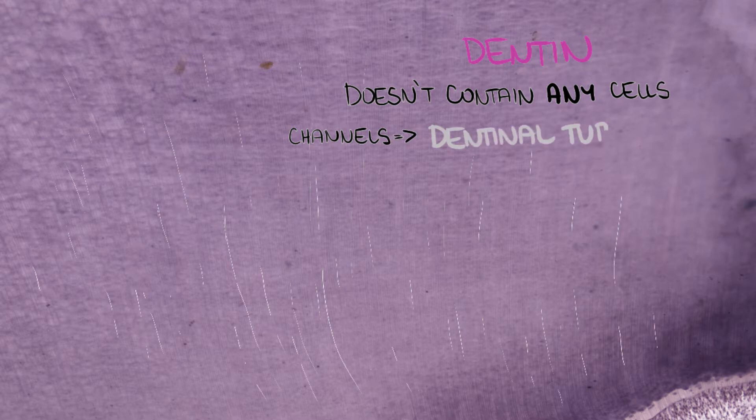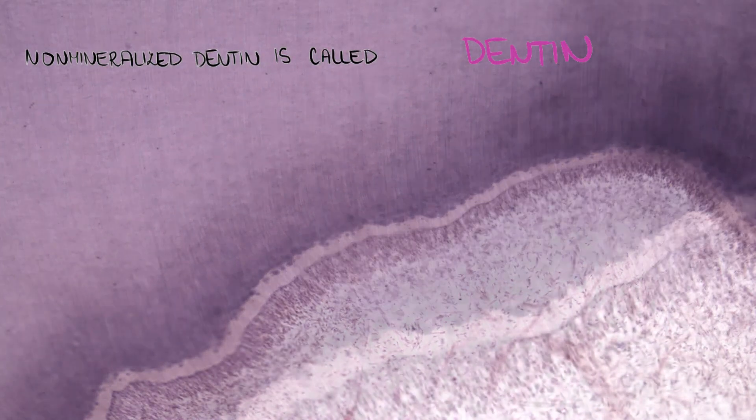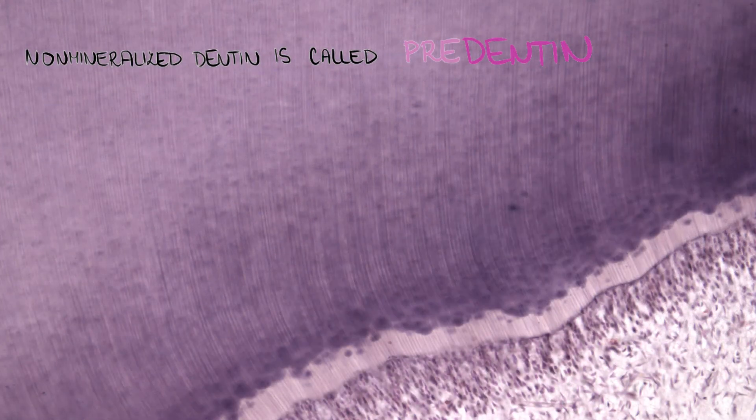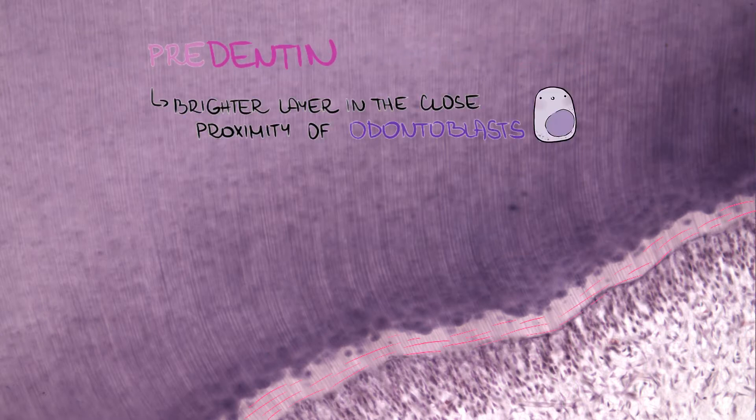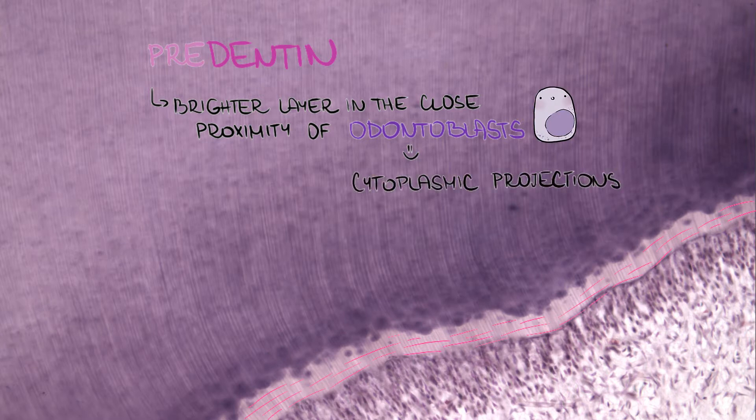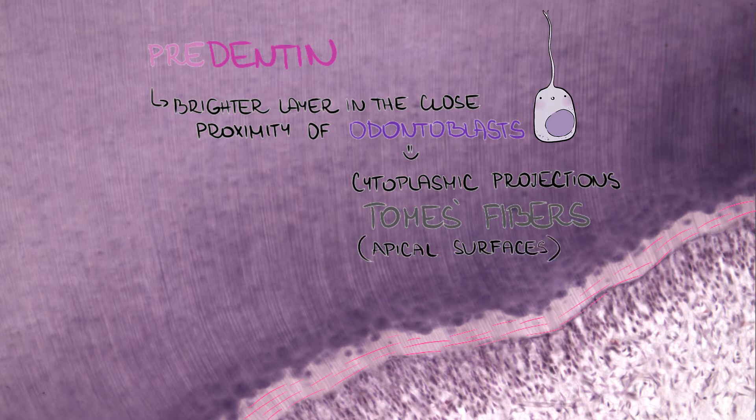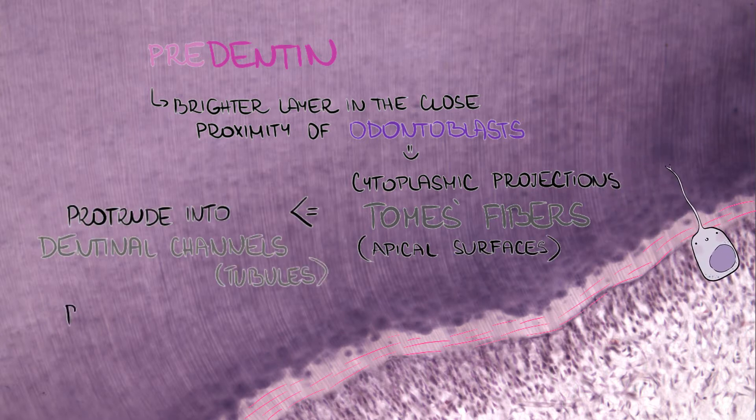Dentin doesn't contain any cells, only channels called dentinal tubules which can be seen in light microscopy. Non-mineralized dentin is called pre-dentin. We can appreciate it as a brighter layer in close proximity to odontoblasts. There are cytoplasmic projections called Tomes fibers on apical surfaces of odontoblasts. They protrude into dentinal channels, produce dentinal substance, and mineralize it.